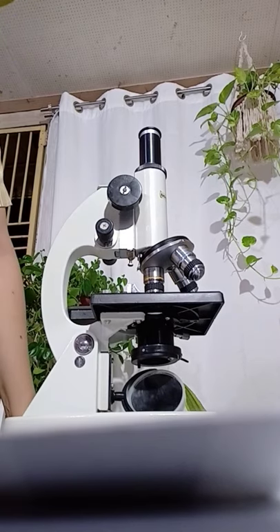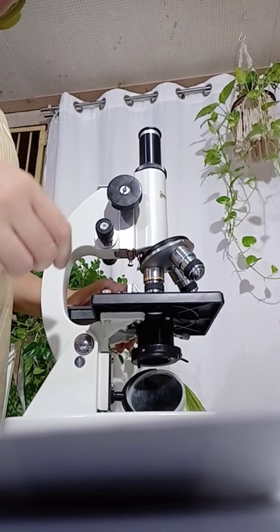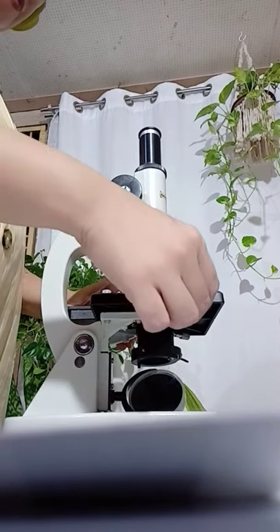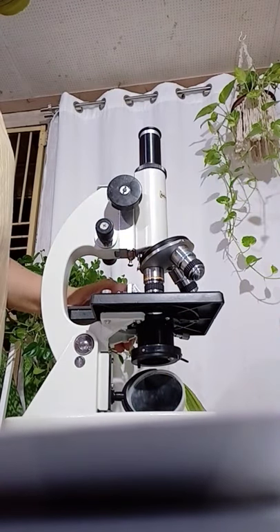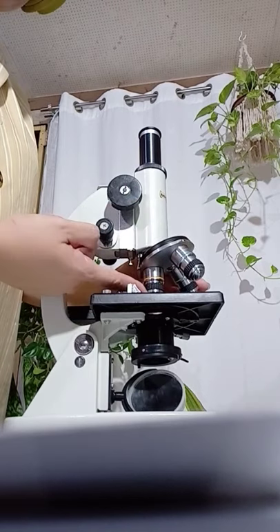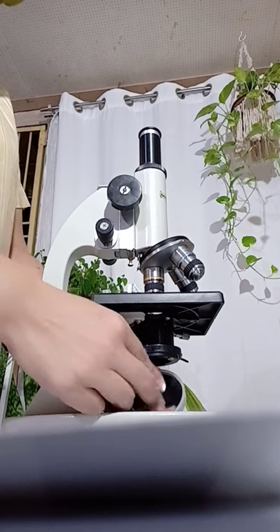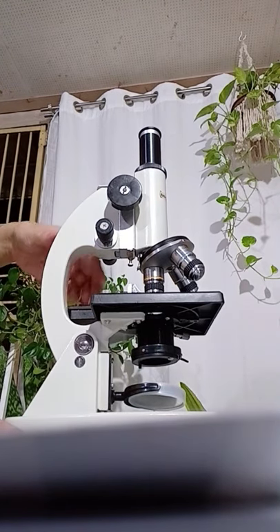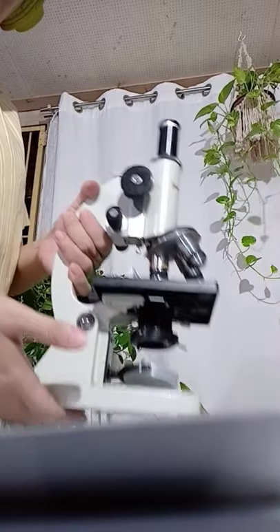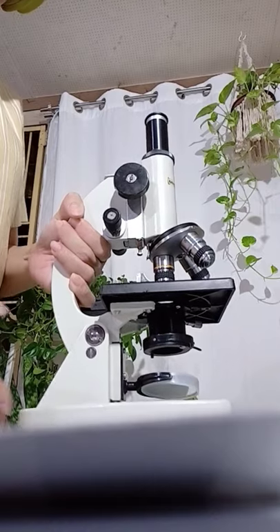Now, how to clean, pack your microscope and return it. Remove the glass slide that you used. Make sure that the lowest objective is in place and the mirror is in place. Then carry it again with both hands, very gently returning the unit to the stockroom.